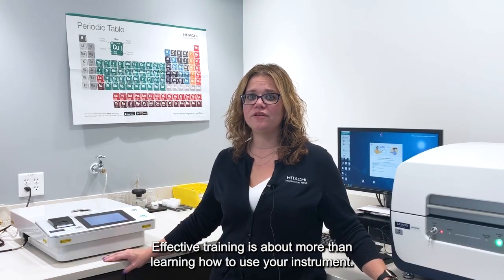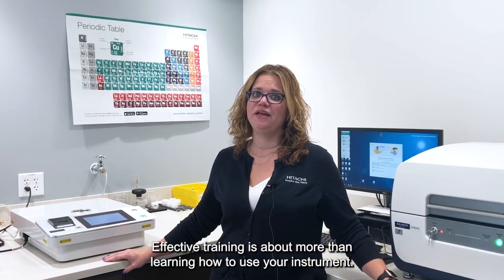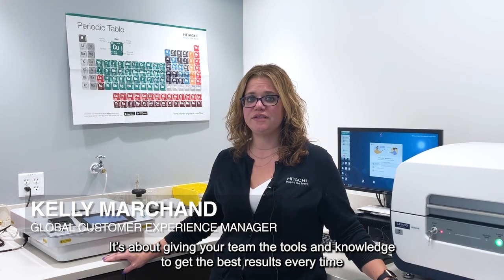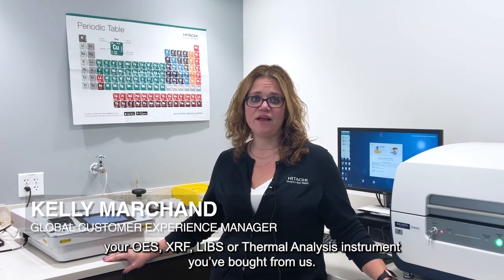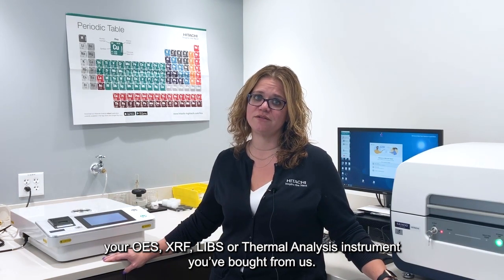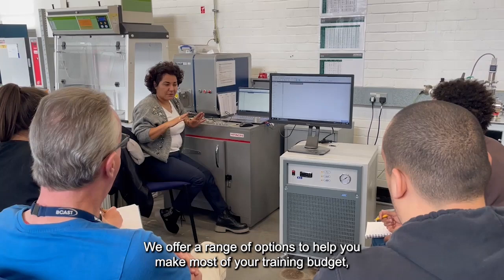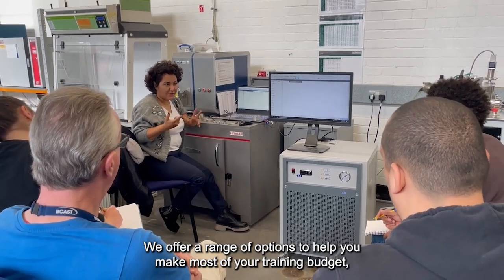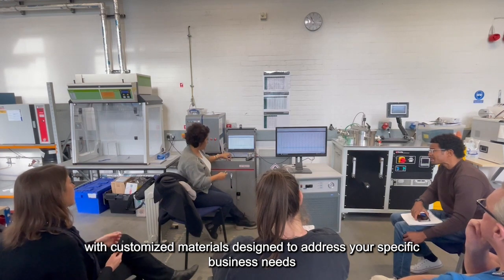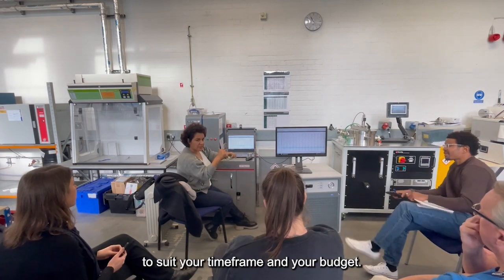Effective training is about more than learning how to use your instrument. It's about giving your team the tools and knowledge to get the best results every time from your OES, XRF, LIBS, or thermal analysis instrument you've bought from us. We offer a range of options to help you make the most of your training budget, with customized materials designed to address your specific business needs, to suit your time frame and your budget.